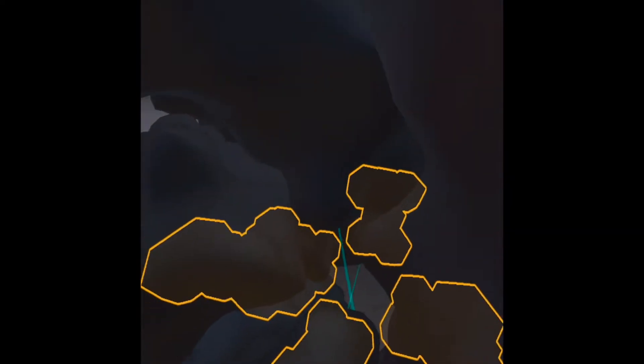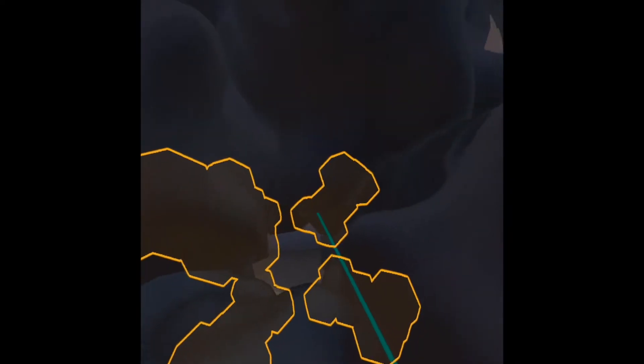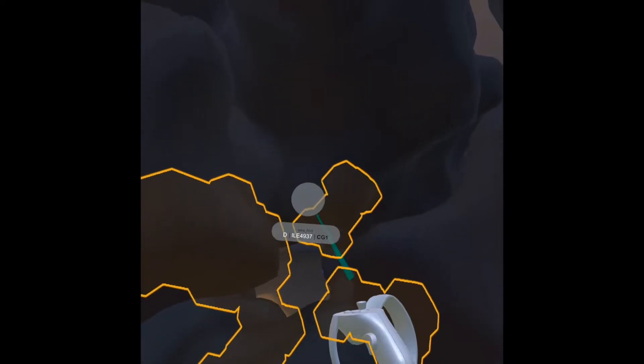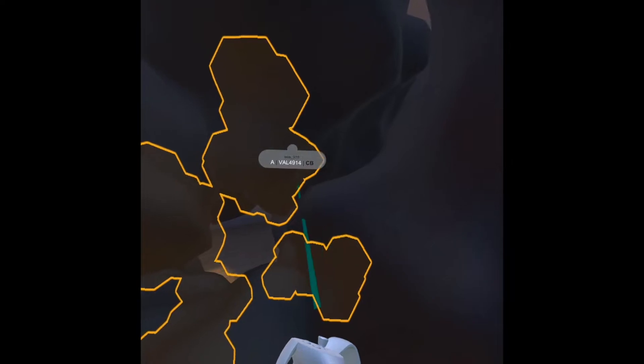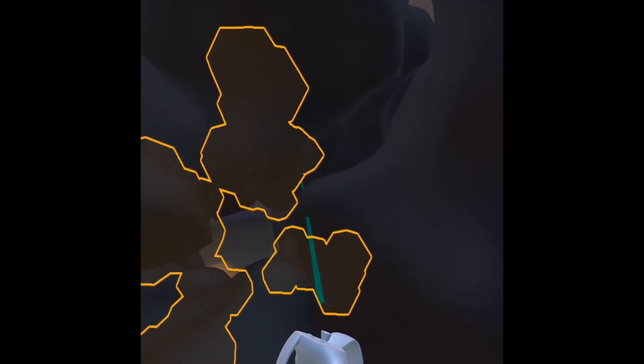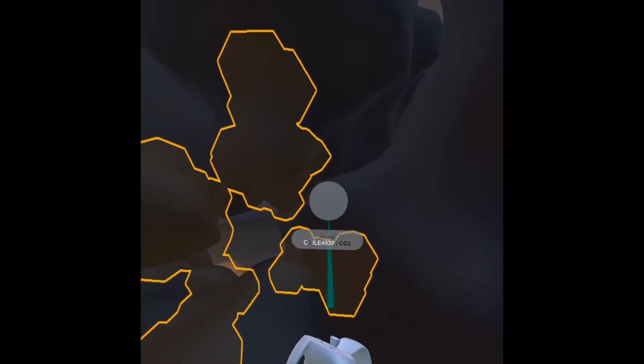It's very natural and easy to see here which are the constrictions, right?